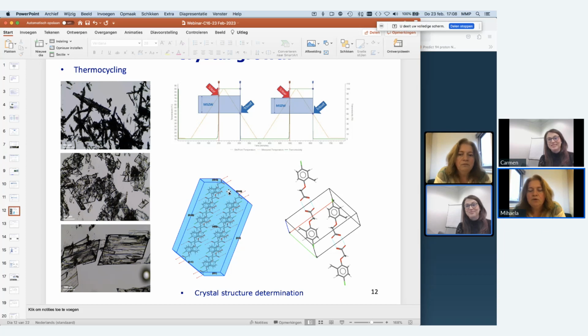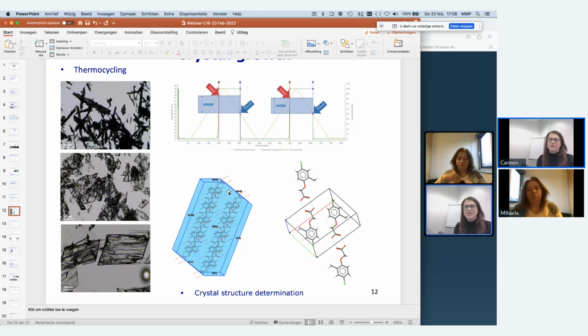Oof. So to prevent crystallization, you can do, for instance, an in situ screening with different, I don't know what is allowed, but an in situ screening to see where it will stay in solution. It's not like an additive, but I would really need to know more details about what is allowed, what you can put in there or not, to keep it liquid. It's more a formulation, I think. We do, for instance, in situ salt screening to keep it in solution and to increase solubility for IV products. With Crystal16, I think it's good because with the turbidity you really see where it works and where not. That's the added value, the beauty of it.